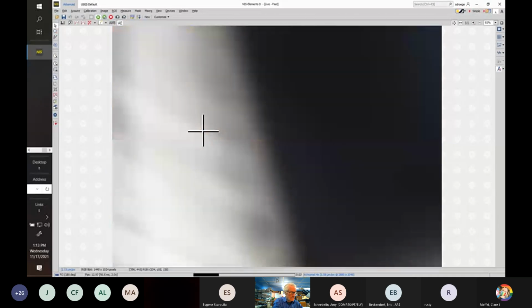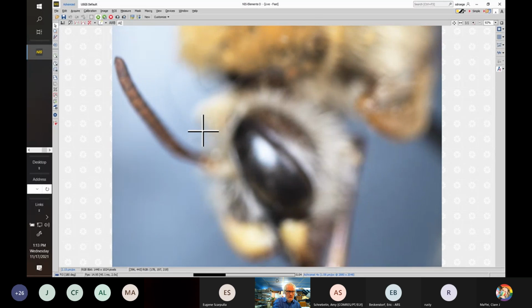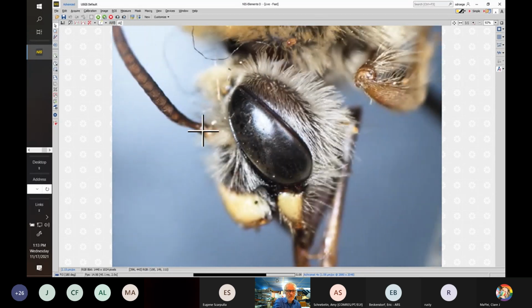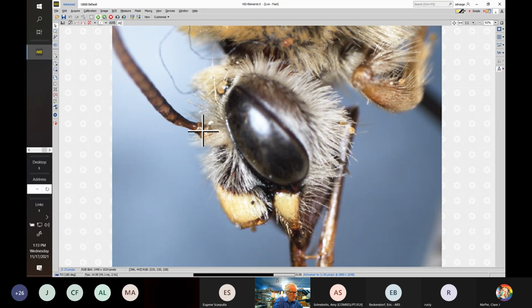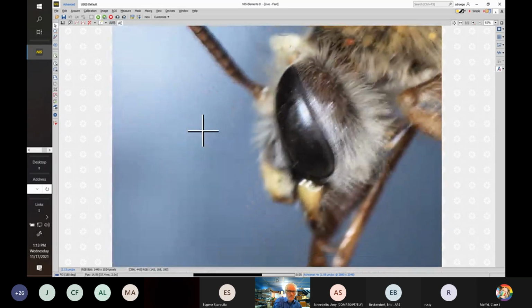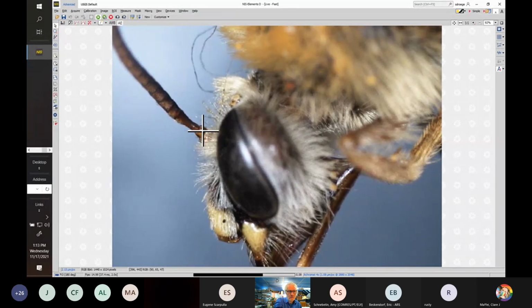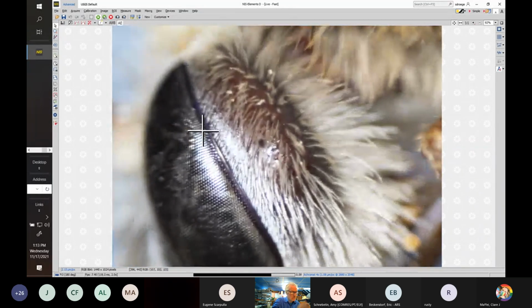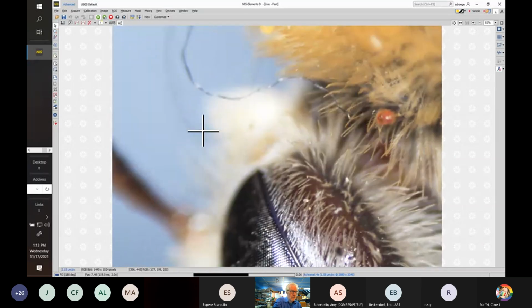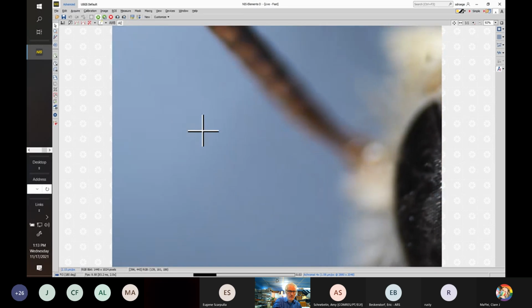And if we look here again, we will look at the length of F1, if I can get a good view of it. F1 compared to F2: it's equal or longer, often about 1.5 times as long. And we'll shift the magnification up, and, oops, try not to bump it.